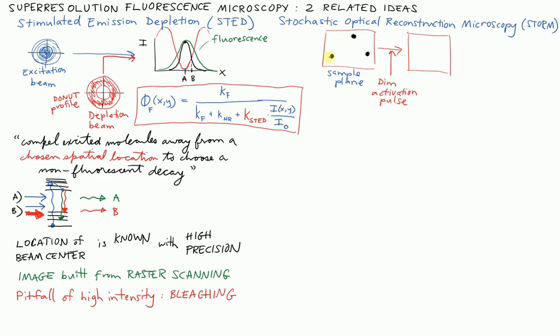And so of our 3 molecules, 2 of them are going to stay exactly in the state they were in. They haven't absorbed anything. But this dim activation pulse, consisting of individual quanta, at one location, and I'll draw it as an open green circle with a little hash in the middle, that one location has become activated.